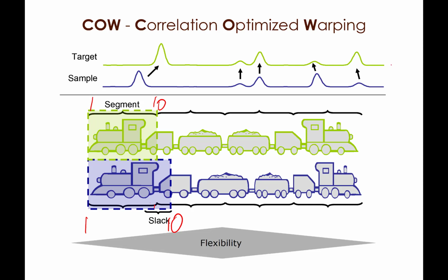You can see that if we align these two signals here, they would have a higher correlation than the raw data, because for example in this position here the correlation is 0, but if they were aligned like this, then the correlation would be much higher.